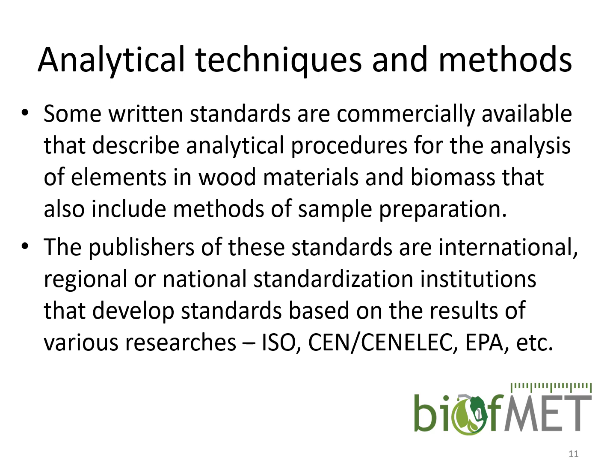Also, in order to distinguish analytical methods in terms of instrumental procedures and whatever laboratory procedures from written standards, it's also important to say that written standards or some normative documents are also already prepared in many different areas, also for the analysis of such wood material, for example, or biomass materials that can be applied successfully, for example, wood pellets.